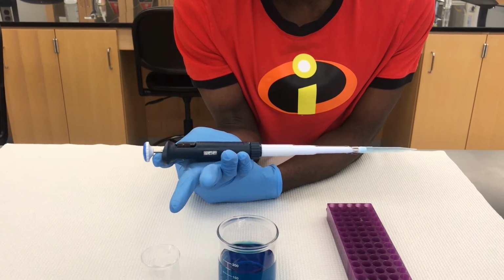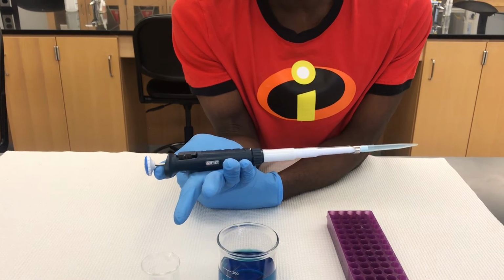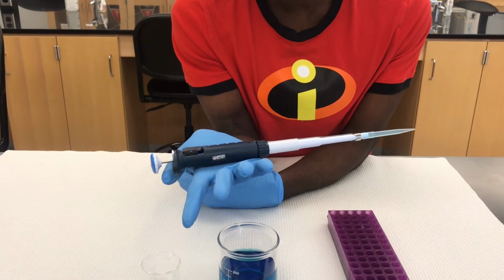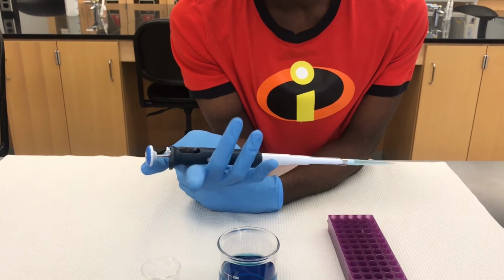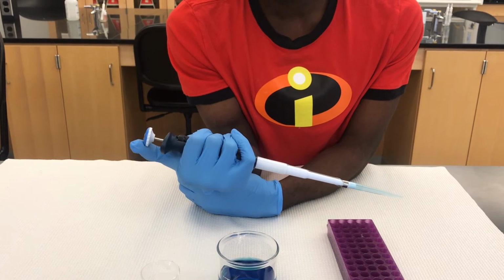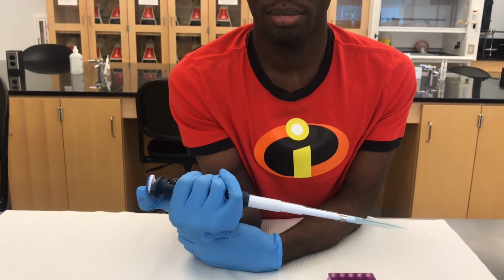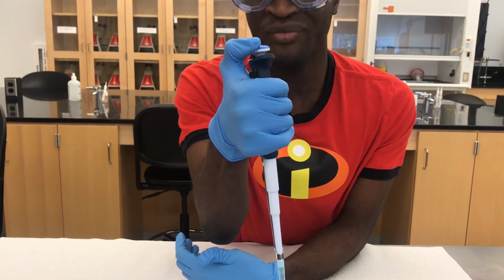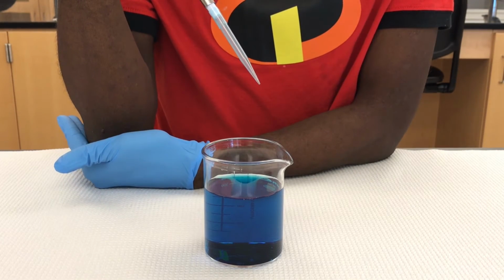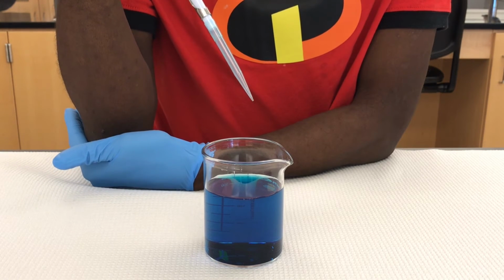Using the P1000, I will now demonstrate the process used to pick up and expel liquid. Grasp the pipette in your hand so the side with the small white ejection button is facing your palm and your fingers wrapped around the volume display window. Place your thumb on the plunger. Begin by depressing the plunger to the first stop. Keep the plunger depressed and the micropipette in the vertical position with the tip facing down. Put the pipette tip into the solution so that it is immersed just enough to cover the end, or between 2 and 4 millimeters.